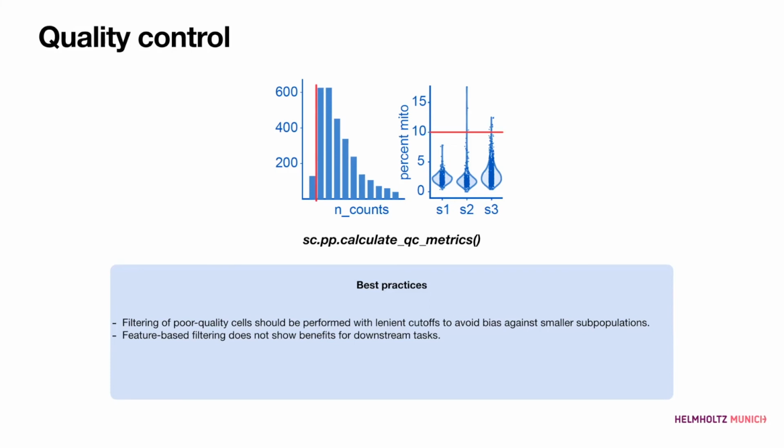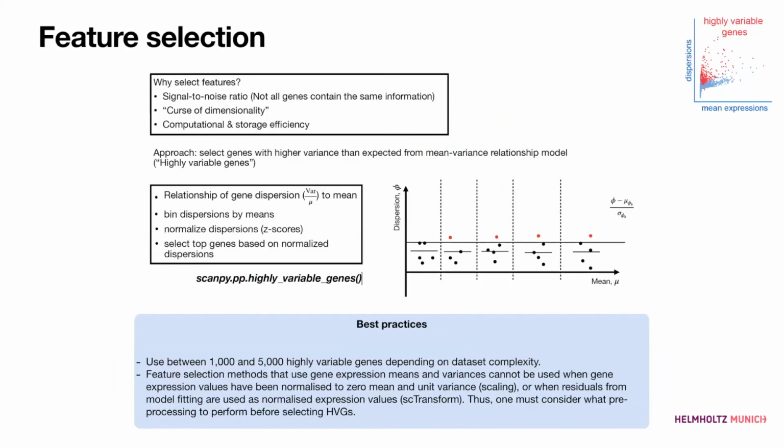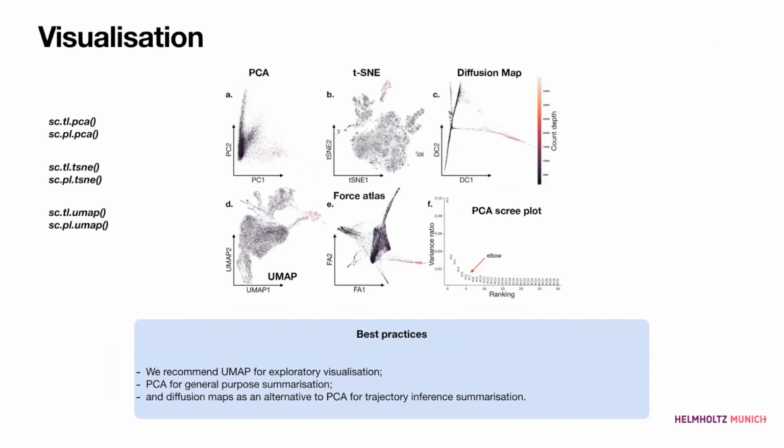Yeah, no, I get your point, because that's exactly what I'm hoping to get, some type of consistency with it, because it's so flexible. I'm just looking to find out what type of thought patterns you use. But yeah, I understand your point. Yes, great. Thank you. Awesome. Great. Thanks. Let me know if there are any more questions, please.